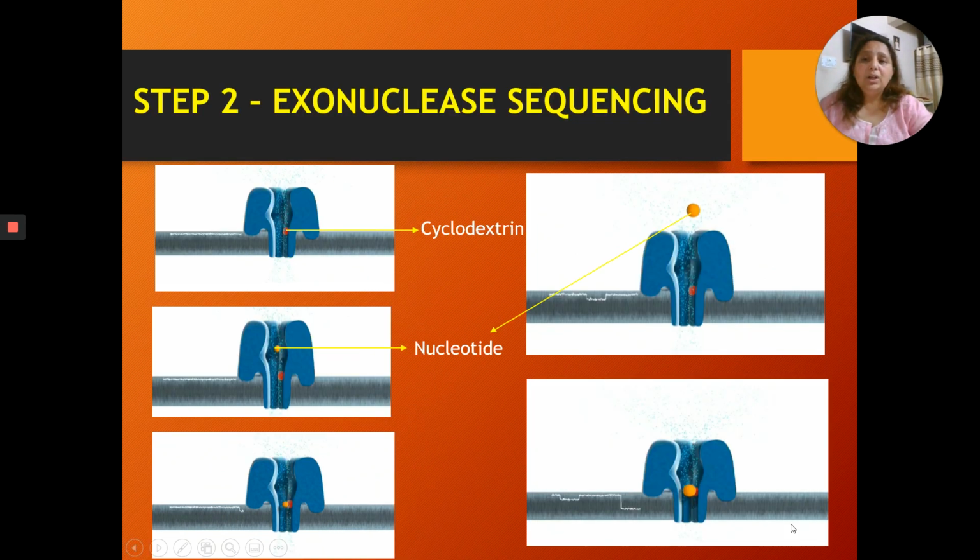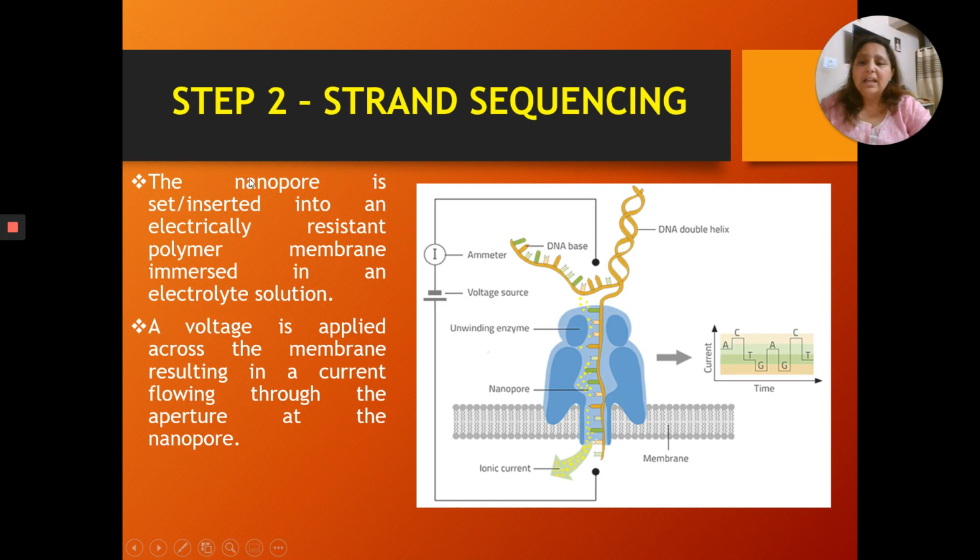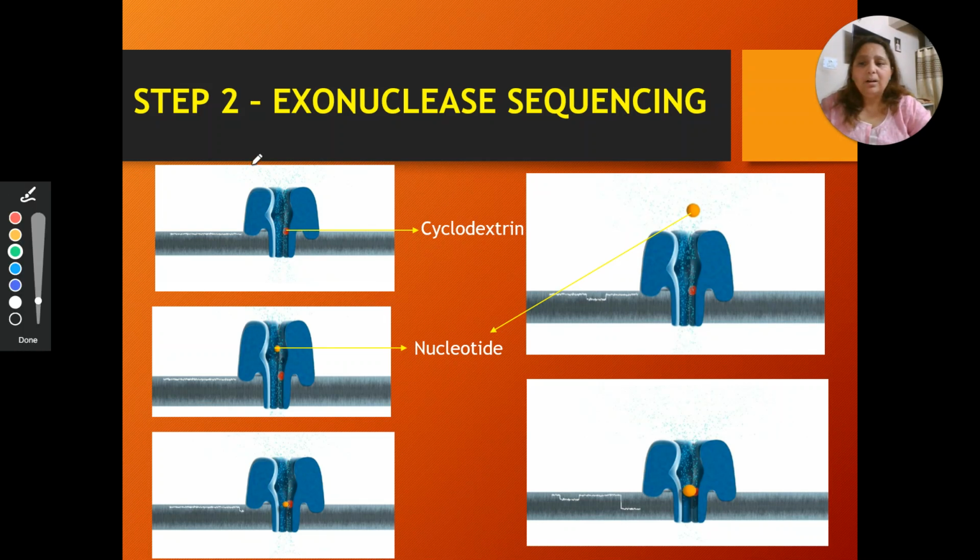Okay. तो बेटा एक्सोन्यूक्लियस सीक्वेंसिंग में होता क्या था? पहले साइक्लोडेक्स्ट्रिन क्यों ऐड करते हैं बेटा? जब ये नेचुरल नैनोपोर और बायोलॉजिकल नैनोपोर्स इन्वेंट हुए थे, at that time उन्होंने देखा कि इन नैनोपोर का स्ट्रक्चर बड़ा ही टिपिकल है, and the typical structure is that these nanopores have a broad end towards the upper side, जिसको हम वेस्टिब्यूल कहते हैं, and a narrow end towards the lower side which is called the barrel, और बीच में एक पार्ट है which is the narrowest part. ठीक है. अब क्या हो रहा है कि the DNA या जो न्यूक्लियोटाइड है ACTGU, they need to pass through the nanopore and reach this end, and in that process they will generate a change in the current.